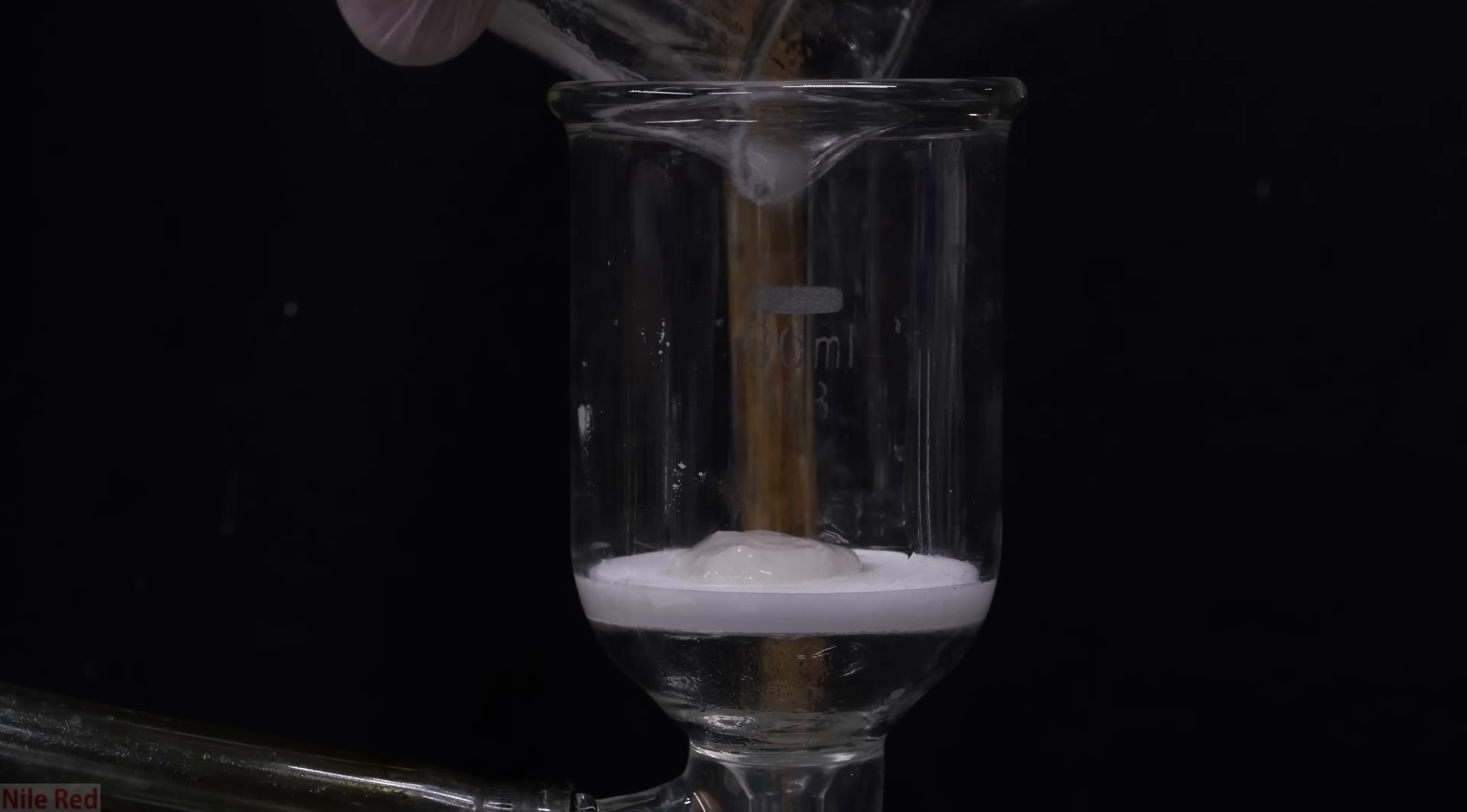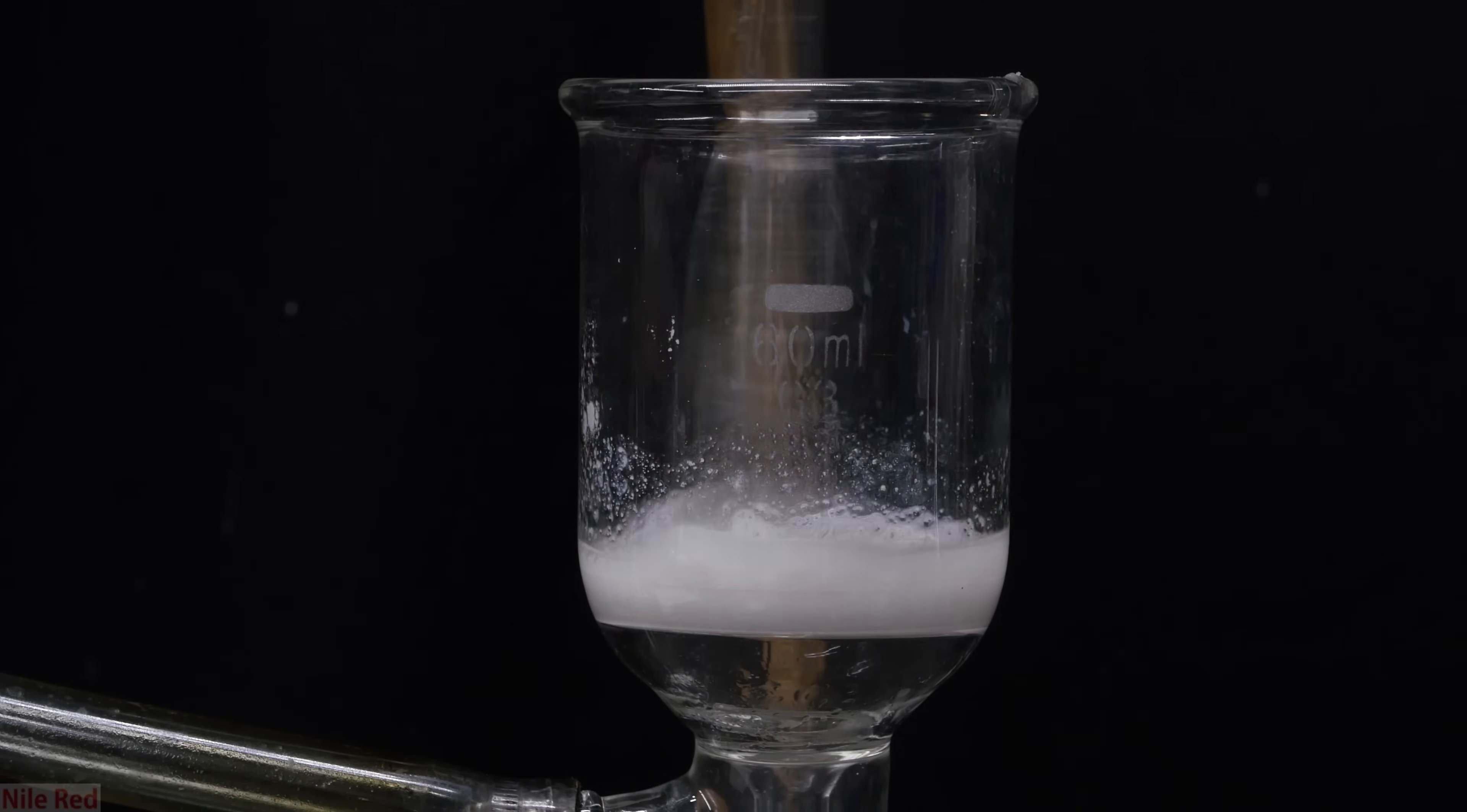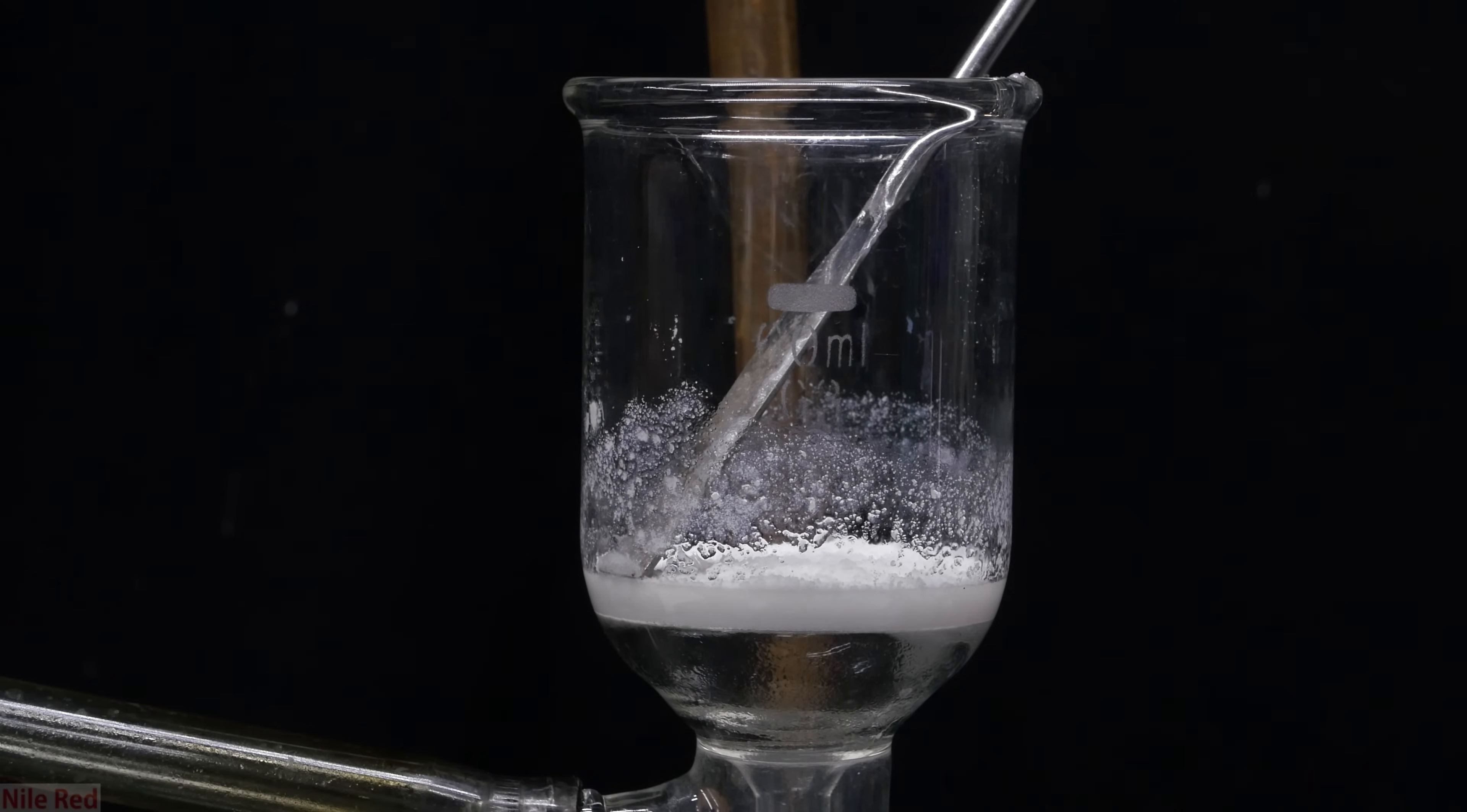I then set up a vacuum filtration to isolate my denatonium benzoate. I also used a little bit of acetone to wash out the beaker. The denatonium benzoate at this point is still really gooey, so I used a spatula to mix it around and wash it in the acetone. After mixing it around a lot, I pull away the acetone and try to dry up the denatonium benzoate as much as possible.